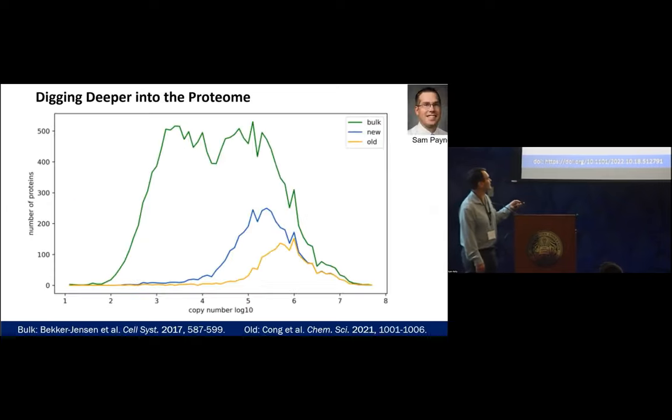And then I can differentiate cells. This is pretty cool. This is something that Sam and Hannah, who is here, worked out. They basically made a histogram based on a Jesper Olsen data set from deep fractionation, large sample amounts of HeLa digest, where they looked at your number of proteins versus your copy number. So going from 100 million to a million on down. And this is what they see.